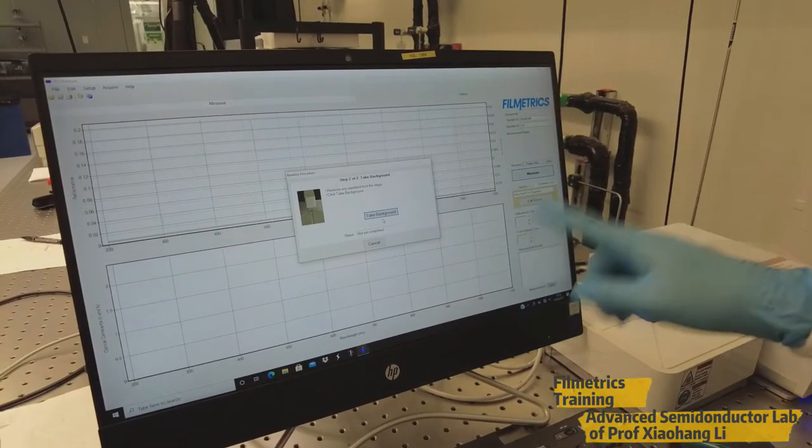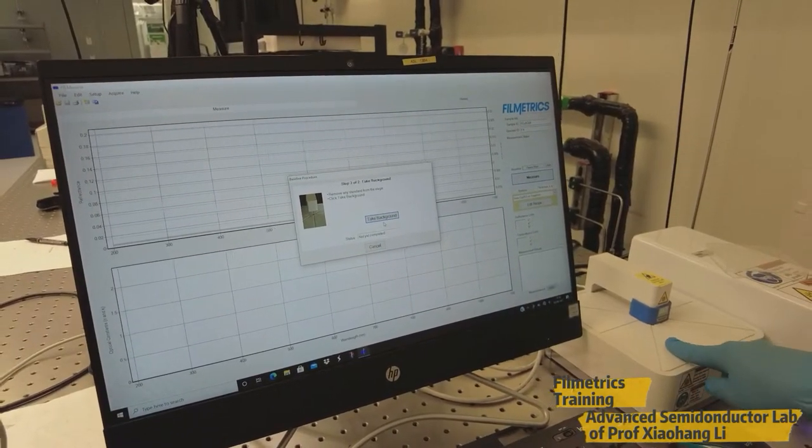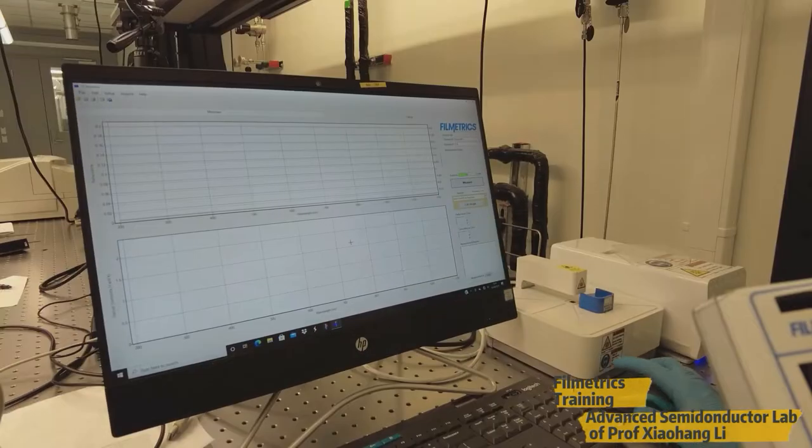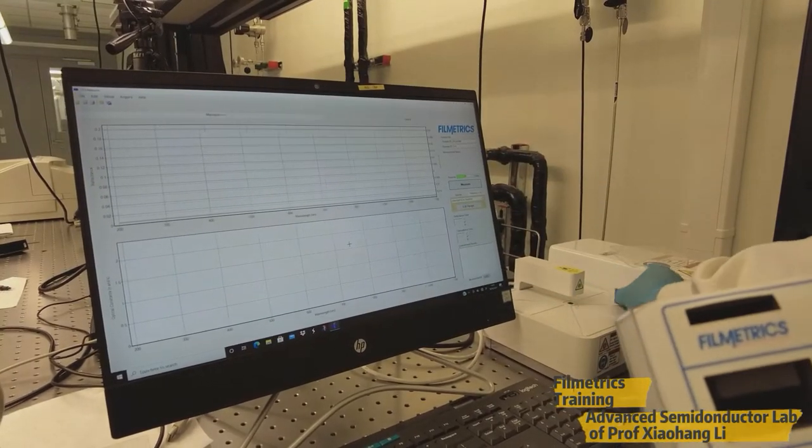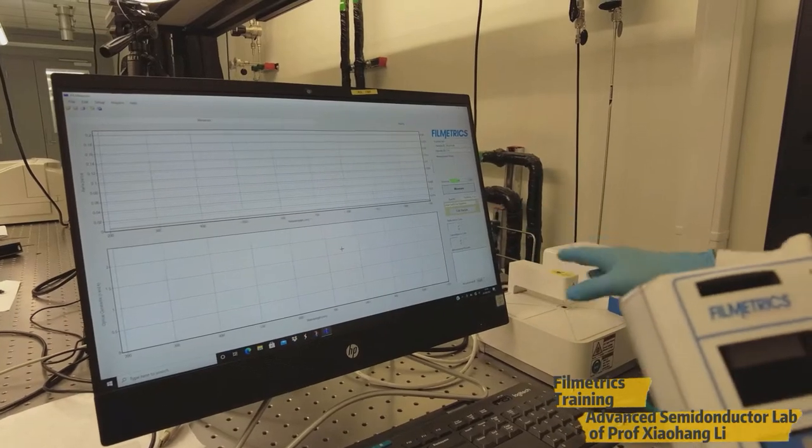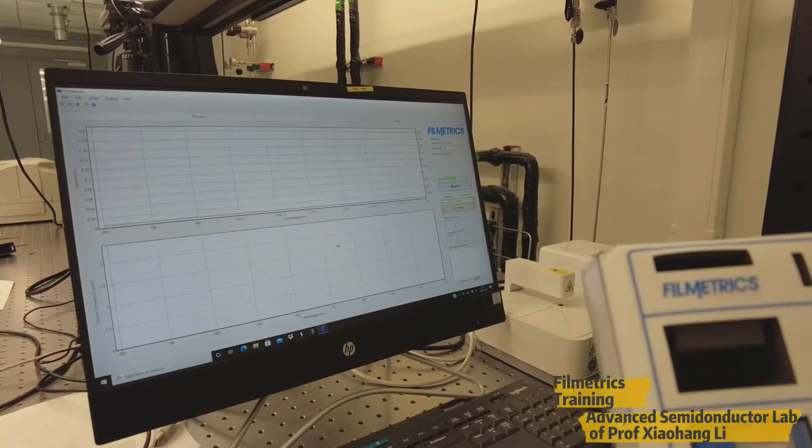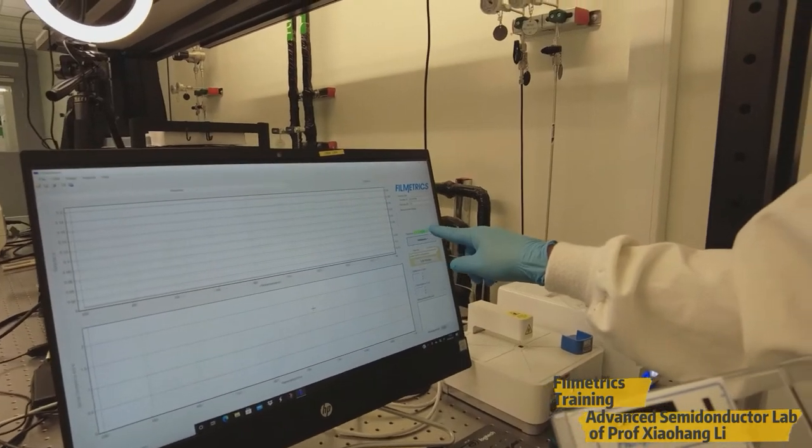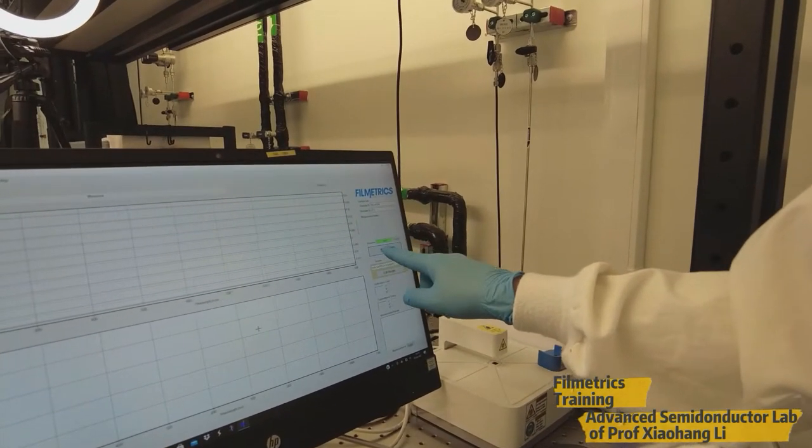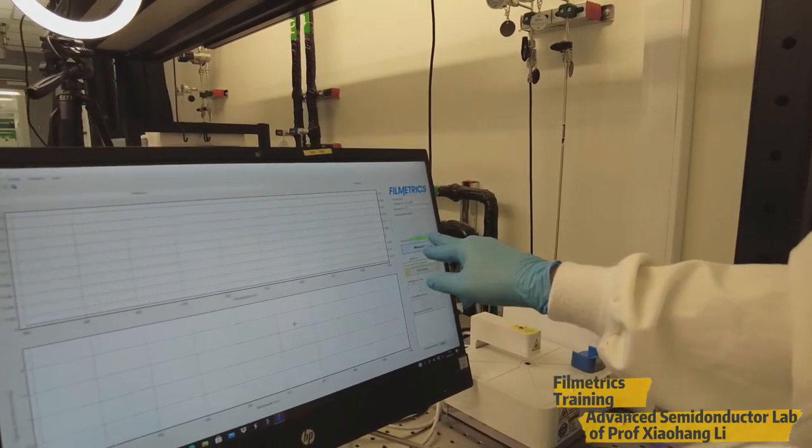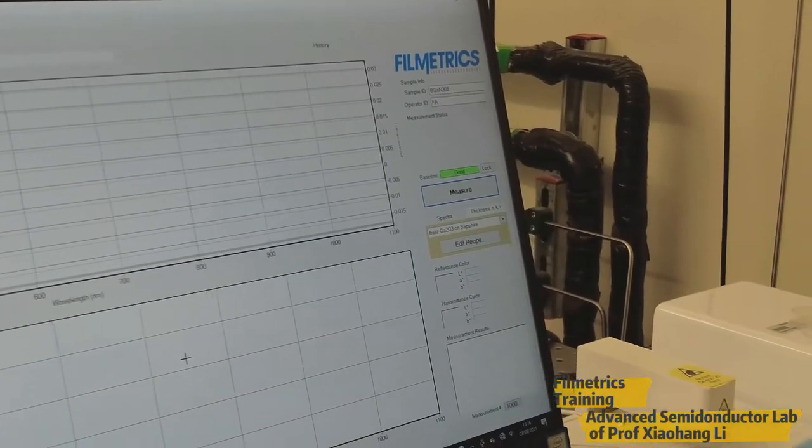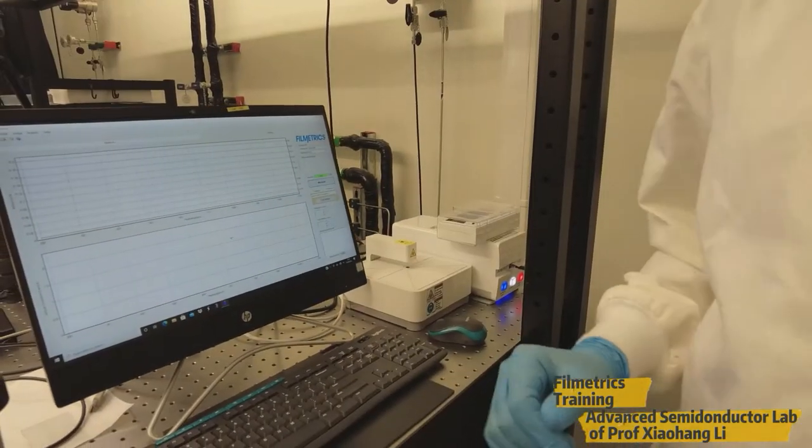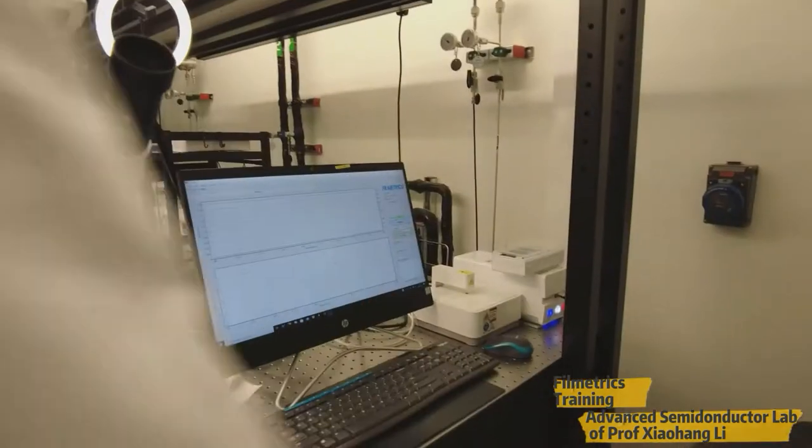So now the standard sample has already been measured. Now we have to take it out and take the background. After finishing this background, then we can measure our samples. As we measured the reflectance standard, it will show the baseline fitting, baseline status. Right now, it is good. So put back the standard sample in the boxes, then take one of our samples to measure the reflectance.